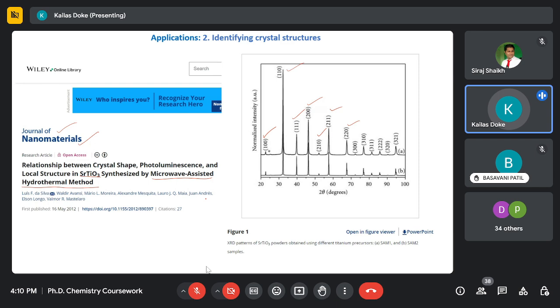They will not analyze what kind of lattices are there, what kind of planes are there, what is the meaning of each peak. But if you analyze such a powder material in a sophisticated instrument with a complete analysis cost of 5,000 rupees for one sample, they will give you a diffraction pattern with auto indexing.